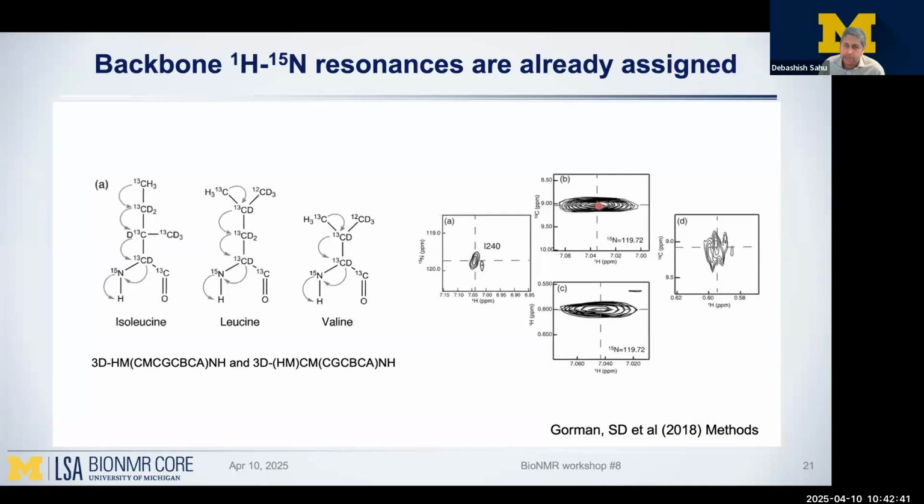So what this means is you have somehow encoded the carbon chemical shift in this particular spectrum and the proton chemical shift in this particular spectrum that corresponds to your proton carbon HMQC experiment. Okay, so basically, if you make this particular methyl sample and you want to assign this and you know this as an answer, you run these two experiments and you can connect them through this particular experiment wherein you label these two carbon and your proton. Okay.